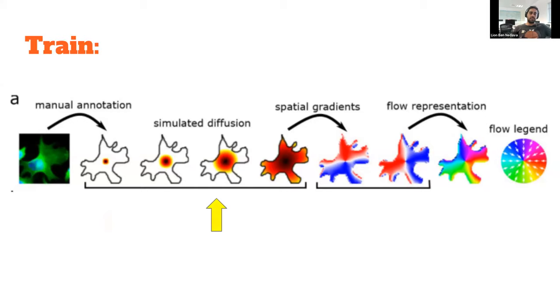Once they have the center of the cell and the outline of the cell, they calculate the height map, like Alon talked about in the key features. Doing so, they treated the center of the cell as the highest part of the cell and the outline as the lowest part of the cell. If we compare it to StarDist, where they extracted the probabilities of whether a pixel is inside the cell or not, here they calculated and produced these probabilities from the height map. They calculated the two gradient maps, vertical and horizontal, and then they meshed them together. Here on the right, you can see the meshing of the gradients, treated like a height map with different directions.